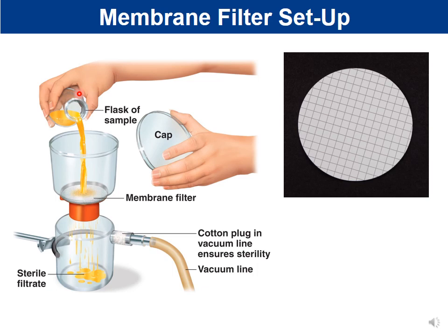So what you would do is you would have your sample of water, and we have this filter setup. Now, on this filter setup, in this cup that we're going to pour the water into, we have a membrane filter. And so in our example, what we would do for today would be that we would use this nitrocellulose paper. Now let's talk about why we use the nitrocellulose.